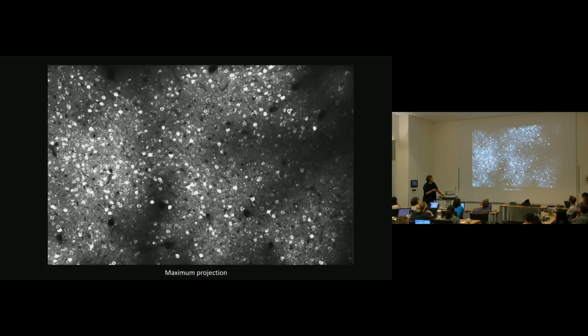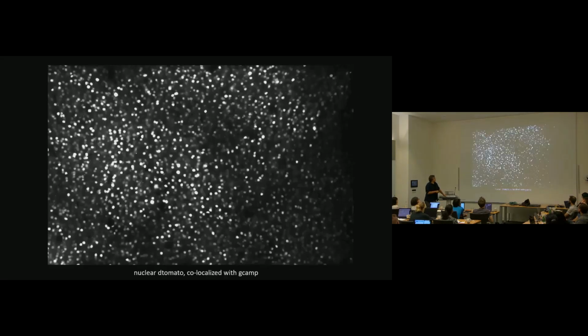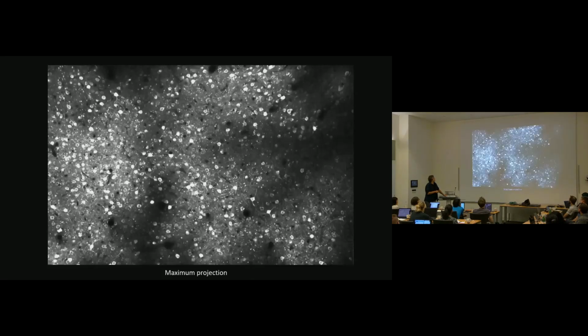We can compare it with the cells, which are in the maximum projection. If you see a cell in the maximum projection, it should be picked up, almost surely will be picked up by suite2p. There might be some cells you can't see here because they're maybe not quite the right shape or dimmer that will also be picked up, but it is a good indication of roughly all the cells there. And so you go back and forth between those, and what you realize is there are a lot of nuclei that you can't see anything over, right? Okay, and so you guys will have this in the example data, and so you'll be able to look at it yourself, get more of a sense. A lot of cells are inactive, so that's the thing to keep in mind. They're quite quiet. And that's not because they haven't been infected, they're just quiet.